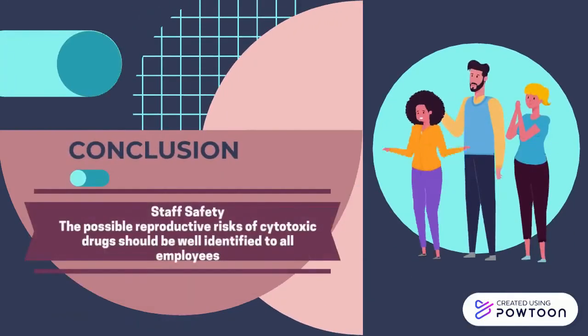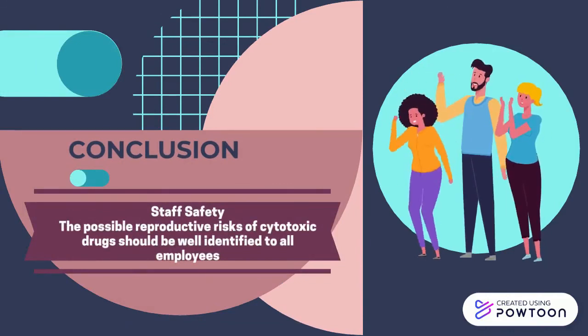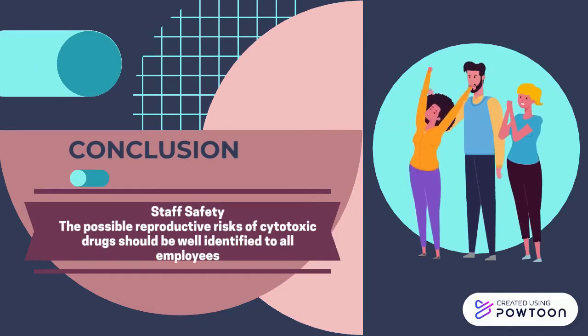Last but not least, staff safety. The possible reproductive risk of cytotoxic drugs should be well identified to all employees.